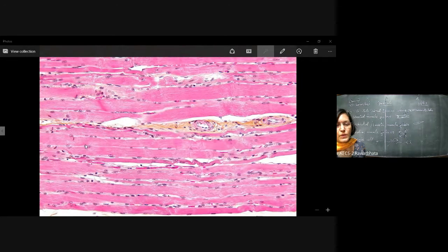This particular one area, if you try to observe very carefully, see light, then dark. Then here light, then again dark. Then light, it goes this whole length of the muscle fiber. Same happens here. You can see this graph-like thing going on, and here, say for example, here it is dark and then the light portion. So these are striated muscle fibers, or the skeletal muscle fibers, or the muscle fibers that are voluntarily present in our hands and legs.